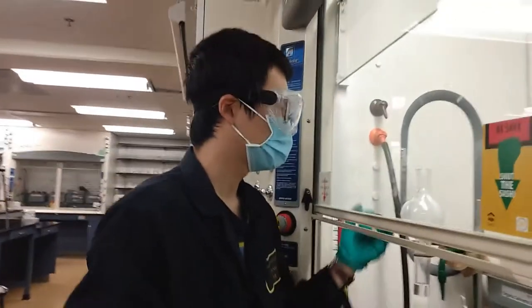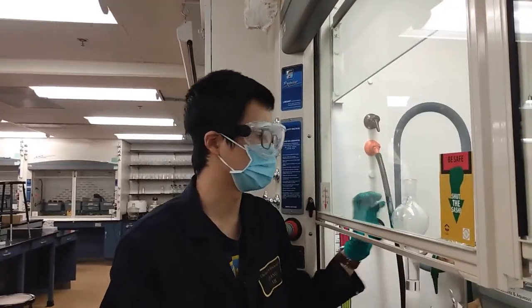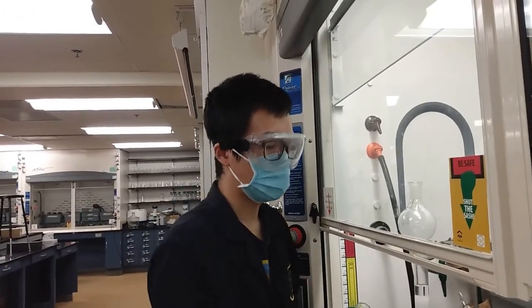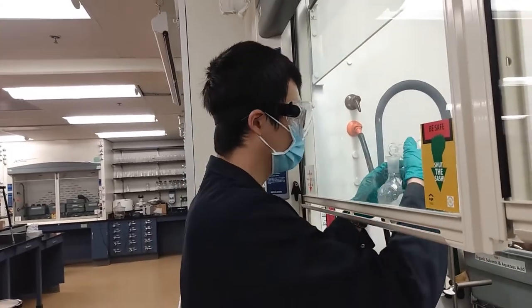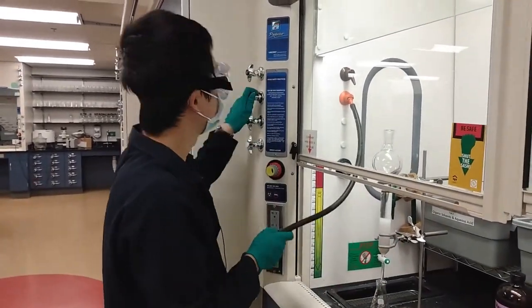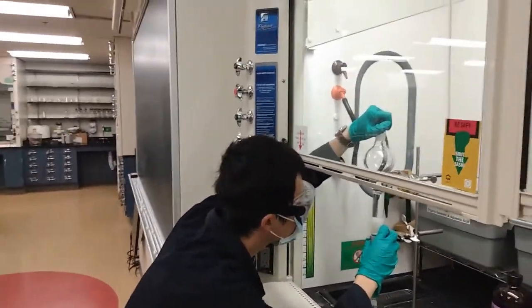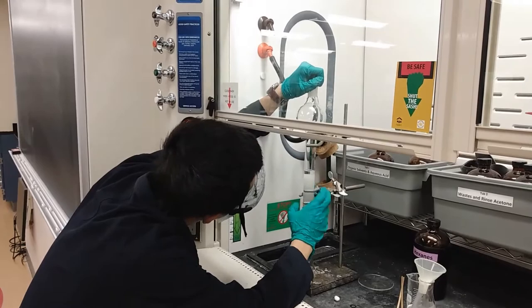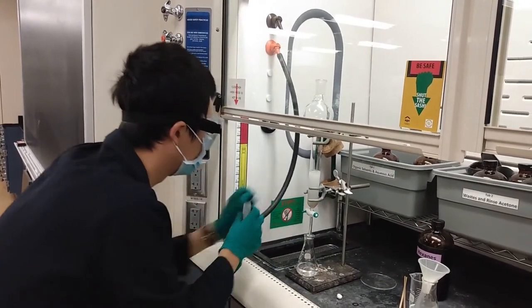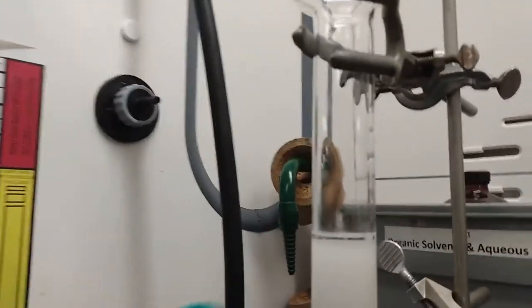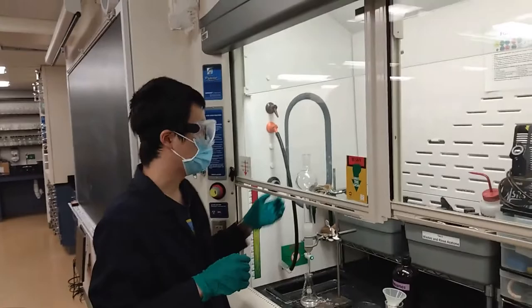We still have some silica gel attached to the side of this column, so we can use hexane to rinse it off. Usually we want a little bit more hexane above the silica gel just in case the silica gel will not dry out at the top. That's how we pack the column.